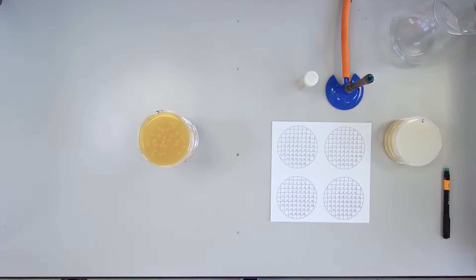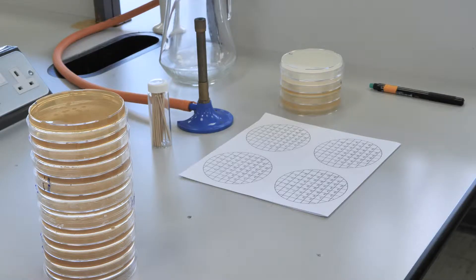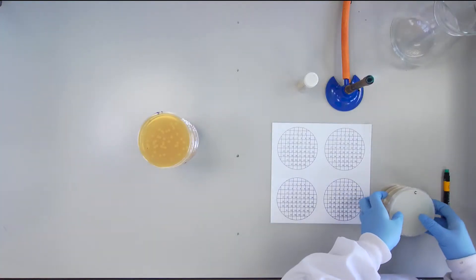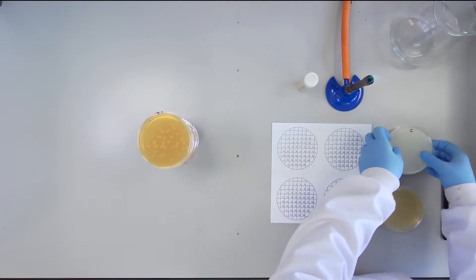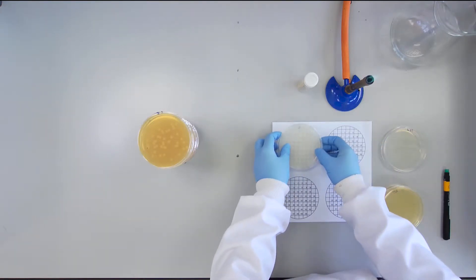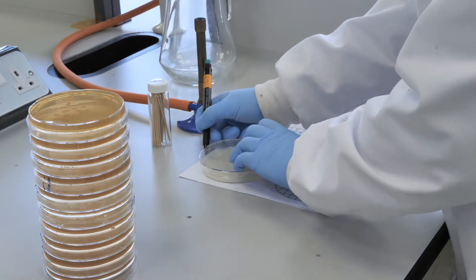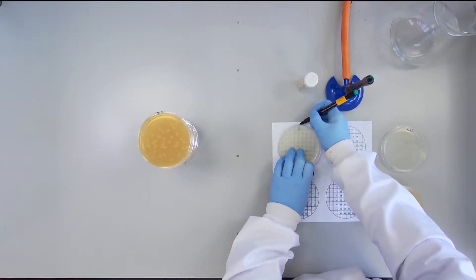The numbers you see will vary depending on the success of the mating. Ten colonies will be chosen at random from your transconjugants for screening. You will use a casein plate, a minimum medium plate supplemented with glucose, a tryptone soya agar plate containing ampicillin and tetracycline, and a starch plate.